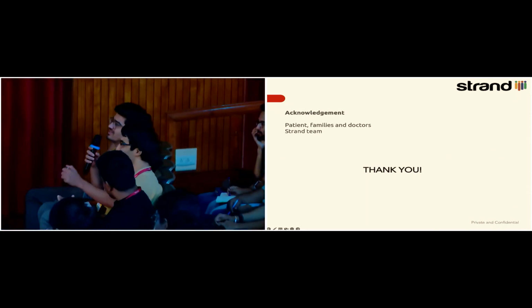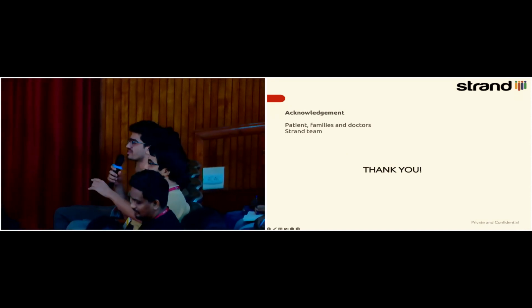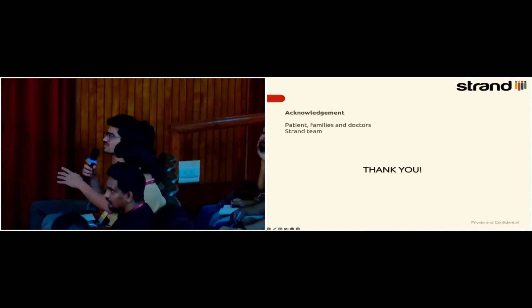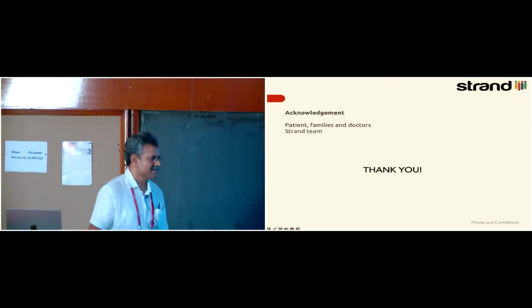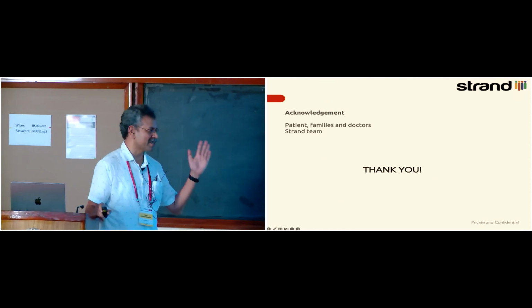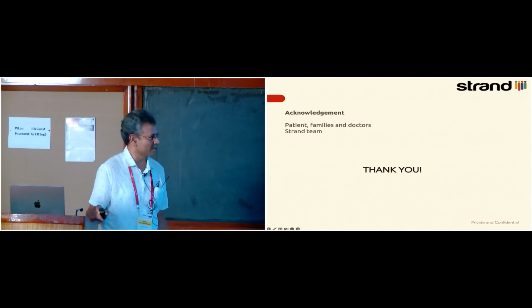So you mentioned that in the genome we'll select some regions in arbitrary ways. So there can be many ways to select the regions. So what is the best way you find to select the regions that suits? Yeah, when you do whole genome sequencing, if you don't have any other criteria, the simplest is the best. We just take 1 MB and just tile the whole genome with consecutive 1 MB or 5 MB regions.